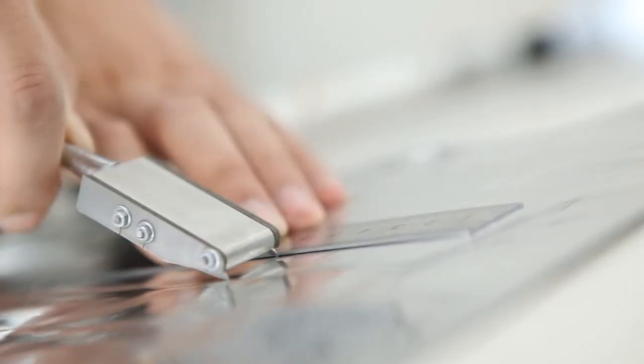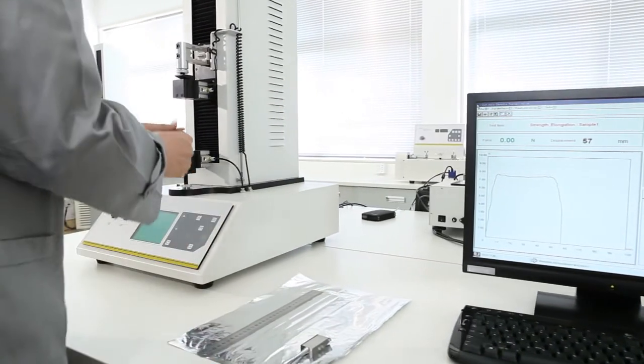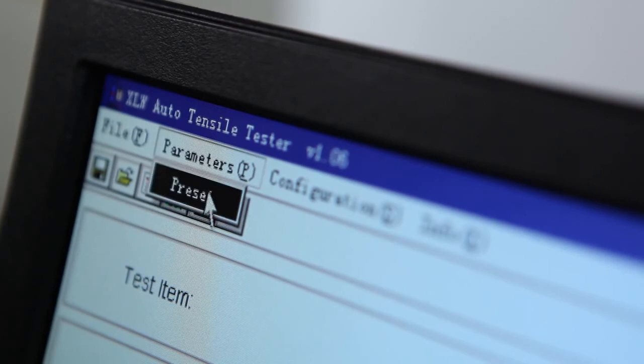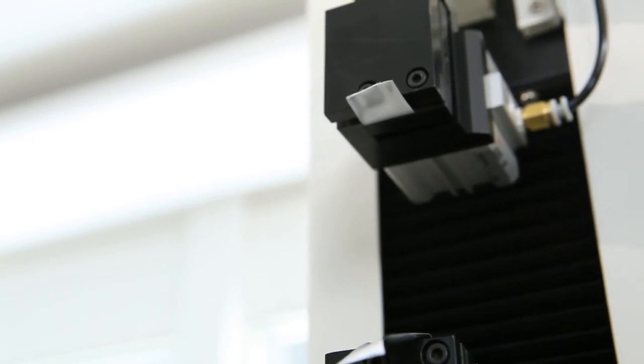Operating the instrument is simple and convenient. Users only need to place the prepared specimen on the fixture, complete the parameter setting, and click on Test. The XLWM will then accomplish the test automatically.